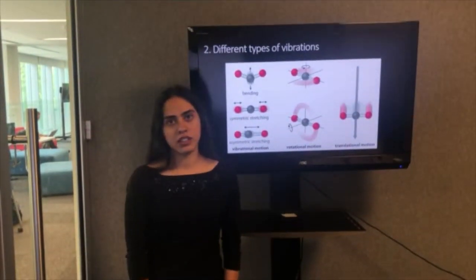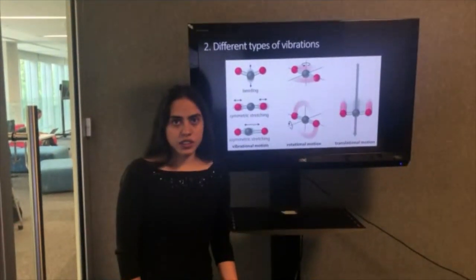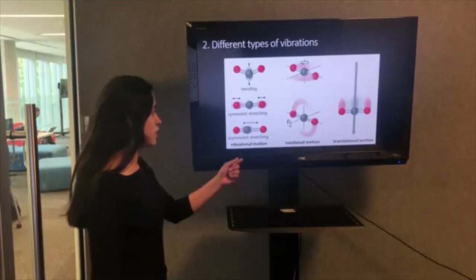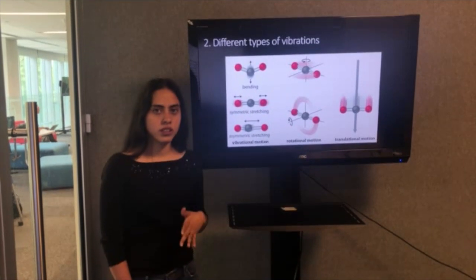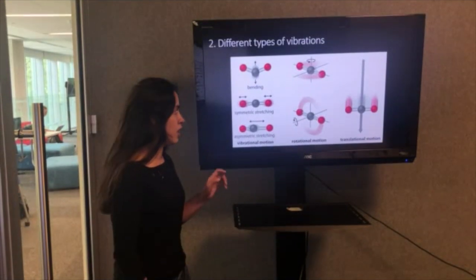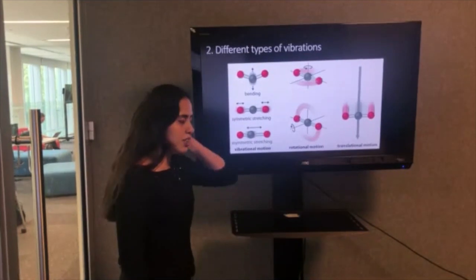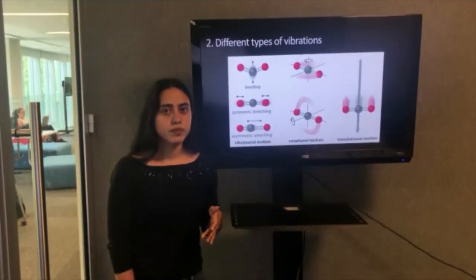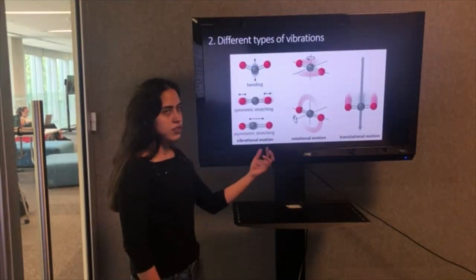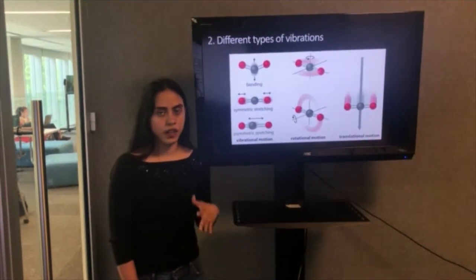The molecules are constituted by atoms linked by electrostatic forces, which move continuously around a position of equilibrium, allowing the molecule to present translational, rotational, and vibrational movements. The total number of movements is known as degrees of freedom. For example, if a molecule has n atoms, it will have 3n degrees of freedom: 3 of translation, 3 of rotation (2 if it is linear), and 3n minus 6 of vibration (3n minus 5 if it is linear).